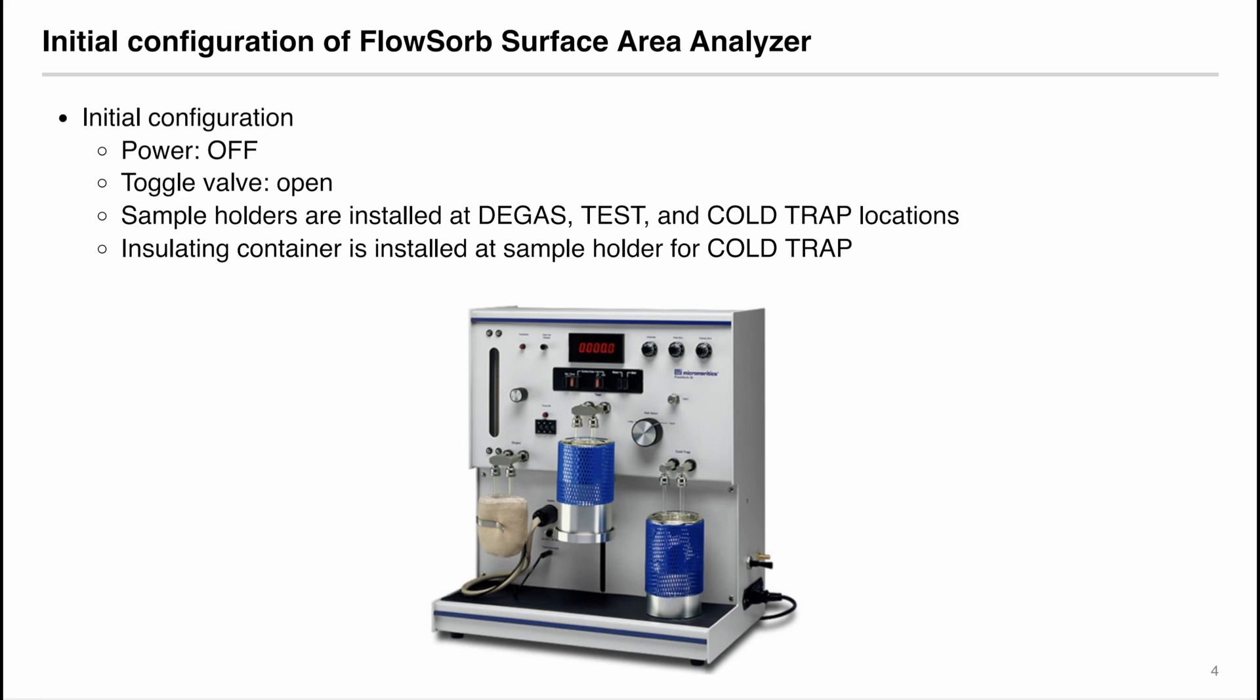The instrument that we're using in the lab is called the FlowSorb surface area analyzer. In the initial configuration, its power is off on the right side. Here is the power button. And the toggle valve should be on. Make sure that you identify the toggle valve and the power valve so they're in the correct positions. We will have sample holders, that is this kind of glass tube, that are installed at the degas, test, and cold trap locations.